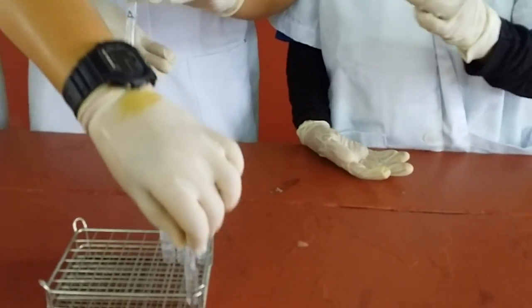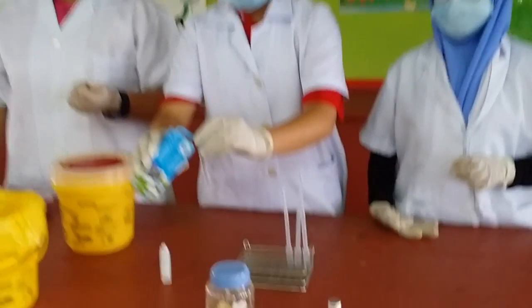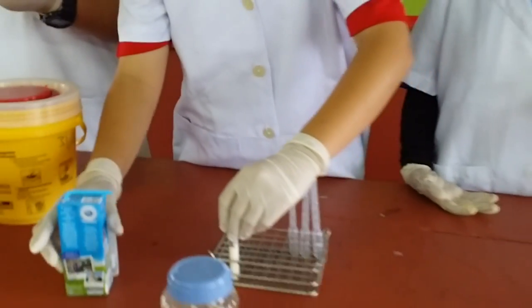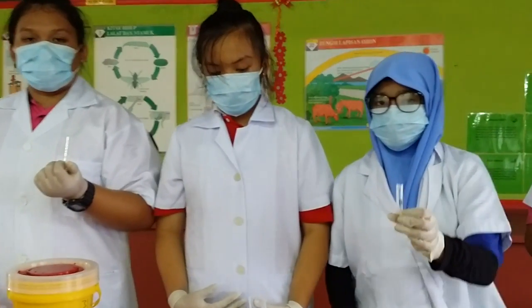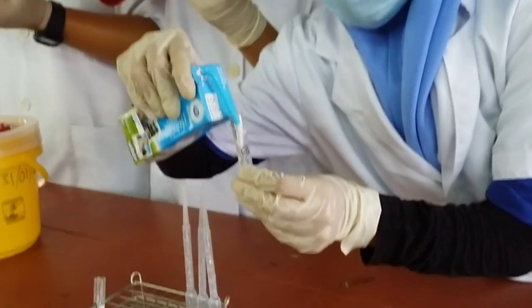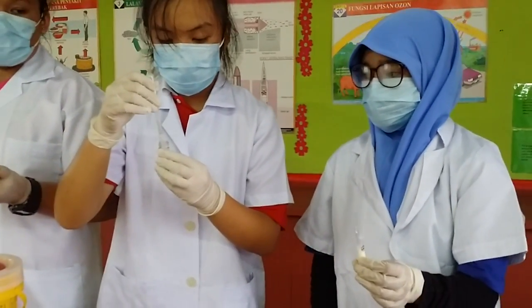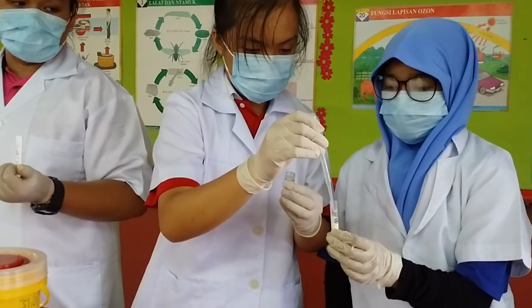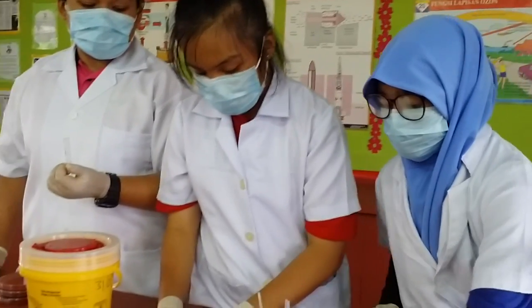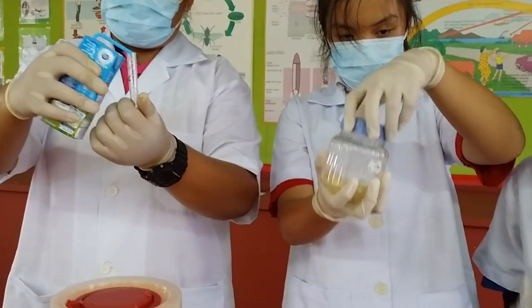Second, we need to take the three test tubes that have been labeled A, B and C. In test tube A, we just need to put the milk in it. In test tube B, we need to mix the E. coli bacteria and the milk. Lastly, in test tube C, we have to mix the garlic juice, the milk, and the E. coli bacteria.